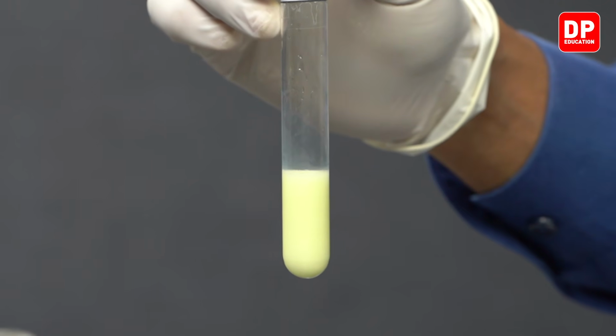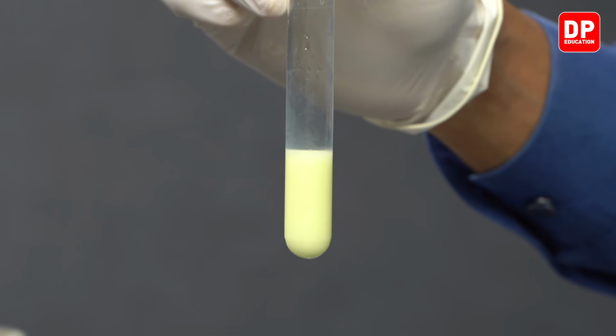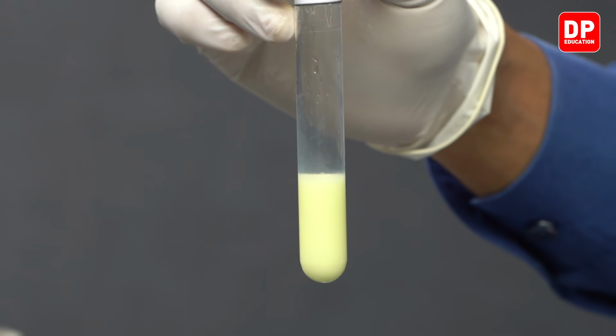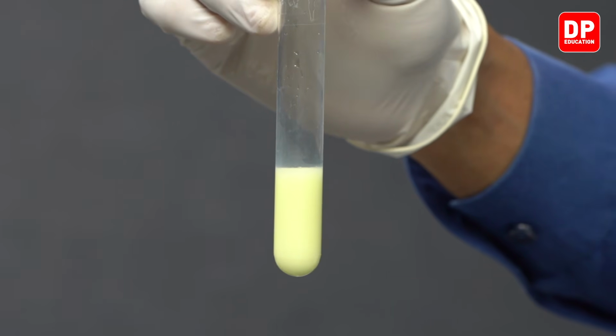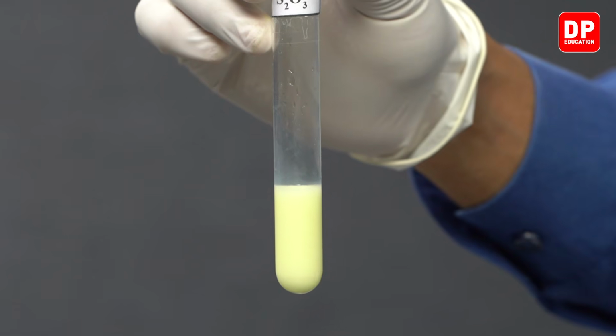When you add hydrochloric acid to thiosulfate solution, you get sulfur solid and sulfur dioxide as a result. And what you observe here is a sulfur solid that is produced, which has a yellow color to it.